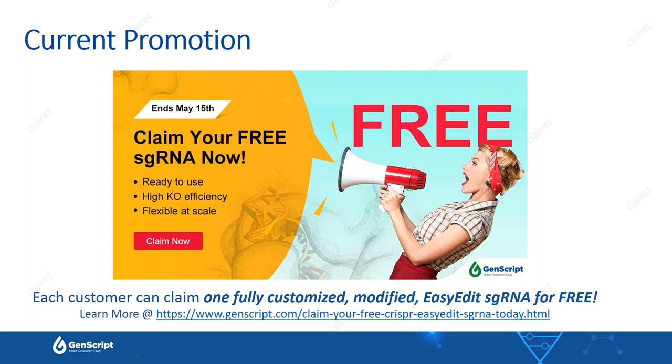Another question, does GenScript work with gene editing in plant cells? So currently I think we sell the CRISPR RNP reagents, and we do have customers we know are using them for plant engineering, but we do not provide that service, which is engineering plant cells. And essentially, we don't have too much experience working in plant cells ourselves. Our expertise is more in mammalian cell engineering, actually.